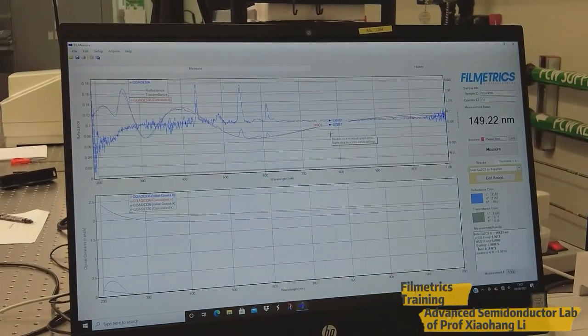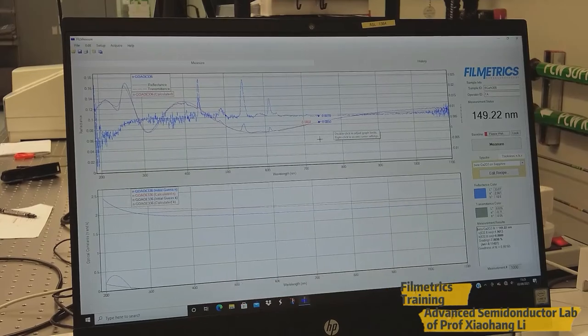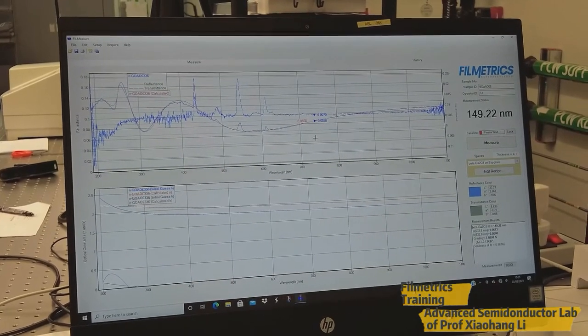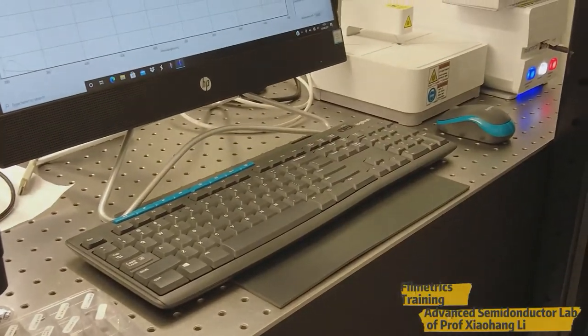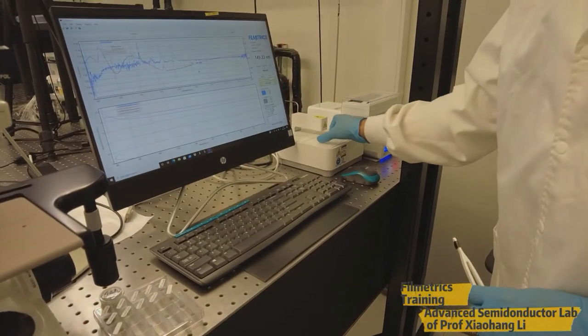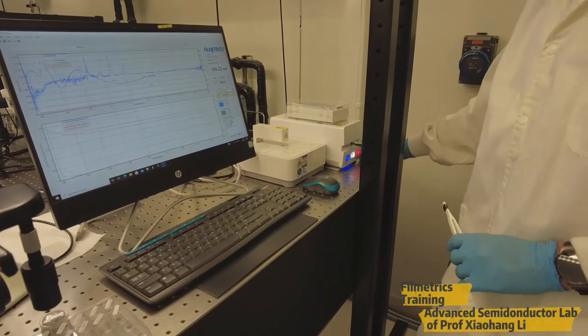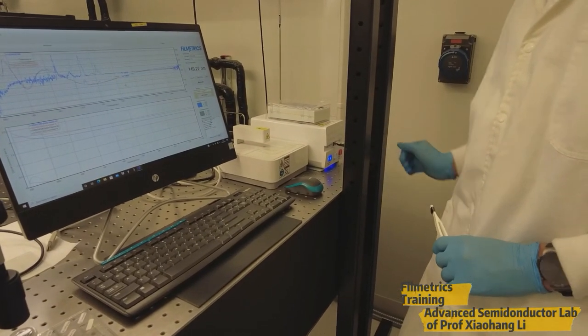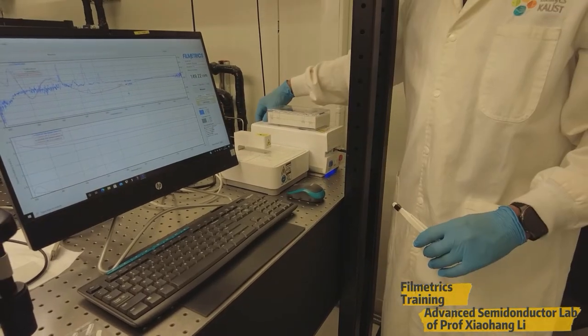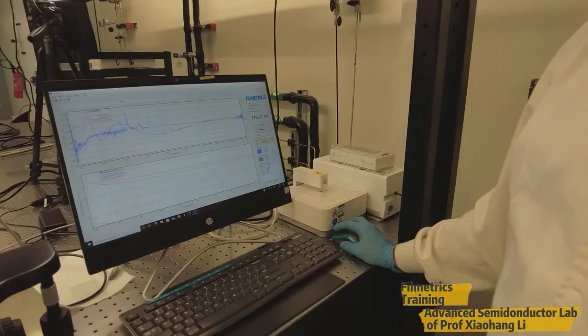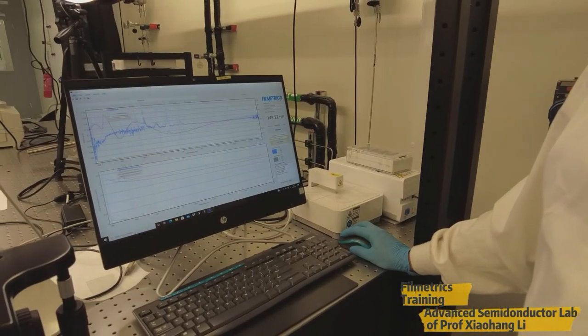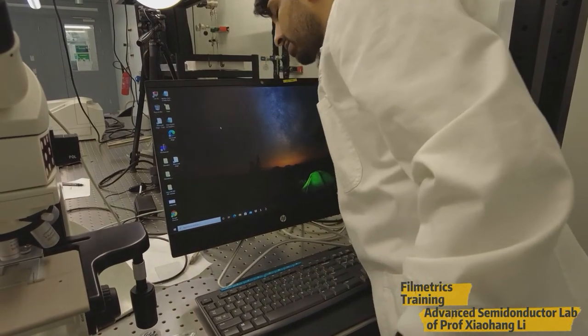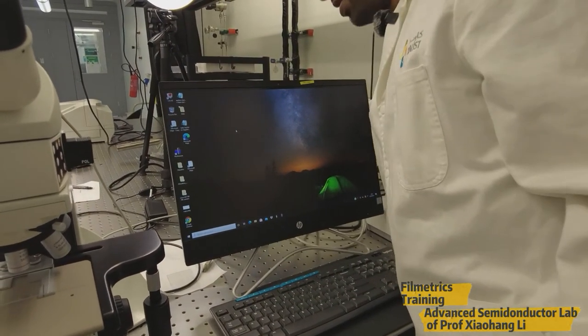So once you finish the measurement, you can take out the sample carefully and gently and close this with this box and turn off these light sources, shutter and the deuterium lamp as well. And close on the backside the power supply. You can close the window and also you can remove this USB cable.